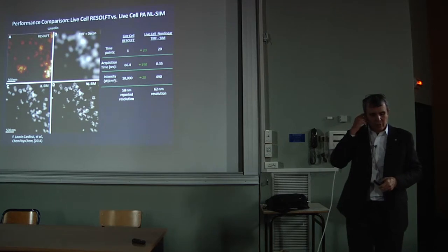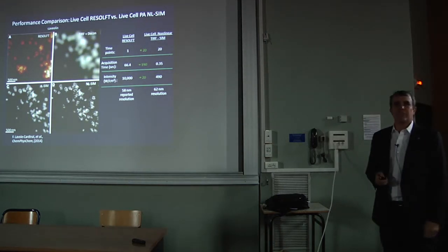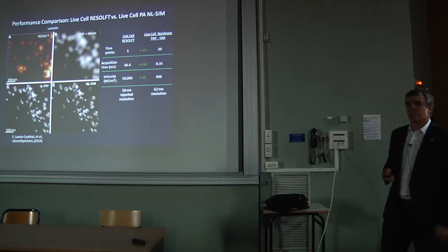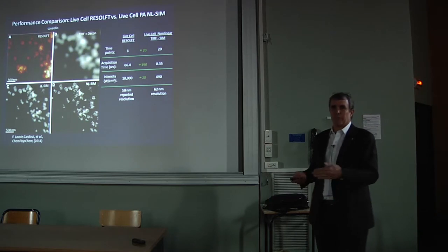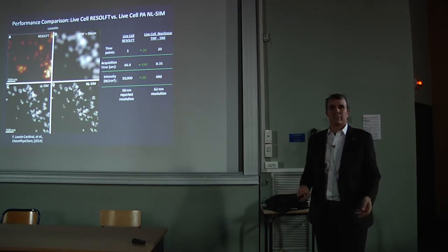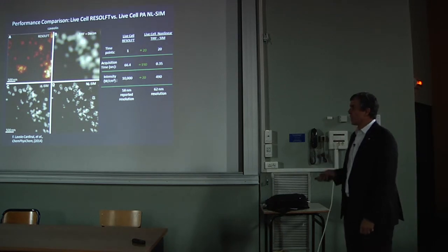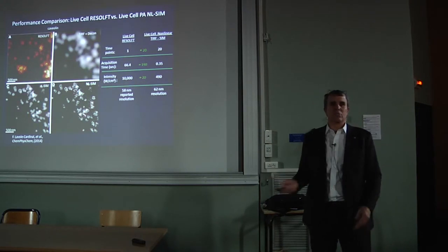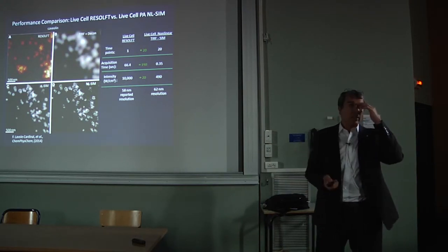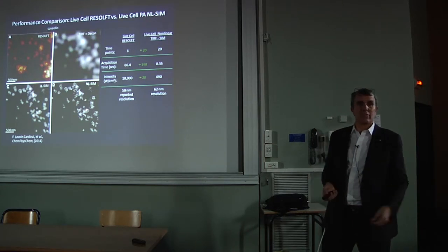So the moral of the story is, in my opinion, many of the claims in the super resolution literature have vastly overstated their real resolution. And it's because they use these line width metrics, which are really not reflective of what happens in dense samples across most of the cell. And so, you really have to look the gift horse in the mouth if you're going to use these tools, and think carefully about the nature of your specimen, whether it's really suitable to get the level of resolution that they claim.